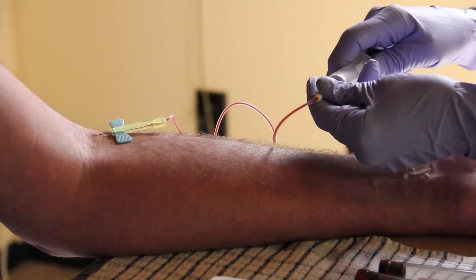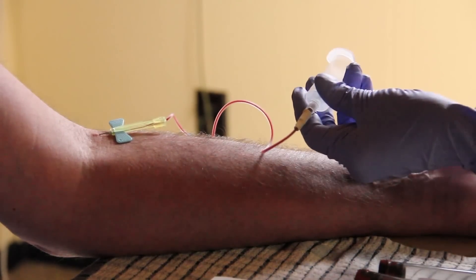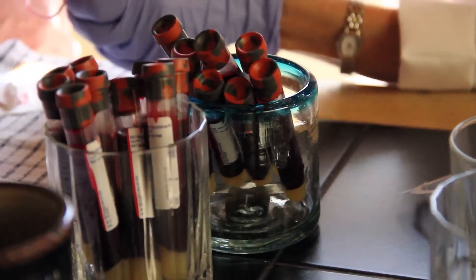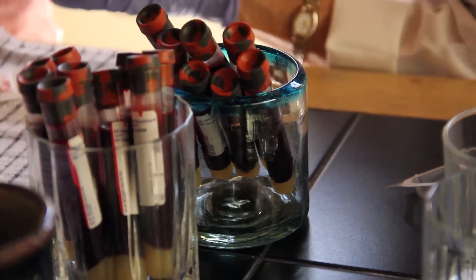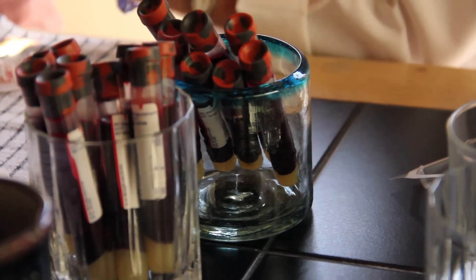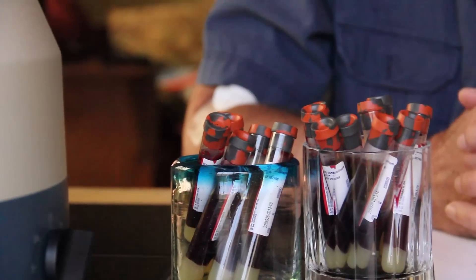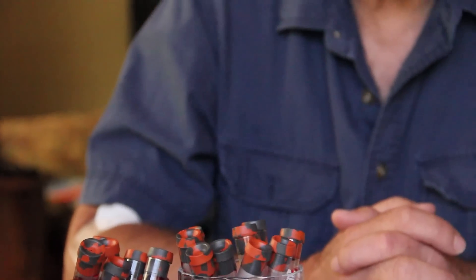I let the blood rest for about 30 minutes before I start the centrifugal separation. You get more serum that way. We finished the blood draw about half an hour ago, so let's go ahead and load the centrifuge and get her spinning.